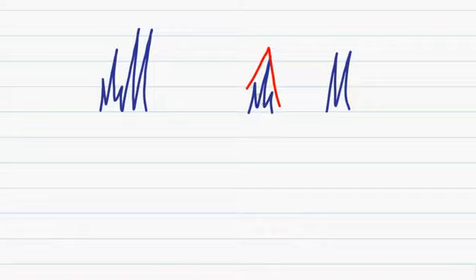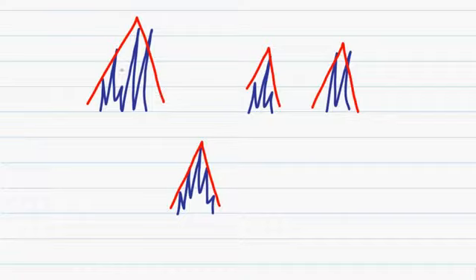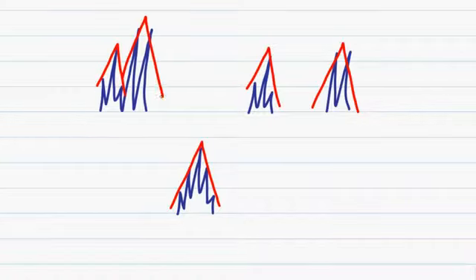Notice that when I draw a triangle over this peak, I wind up hitting every single tip. Same thing for a doublet. And the same thing applies for this complicated quintet. However, going back to my original peak, if I try to do the hat trick, notice that I have this peak right here that does not fit and so I know that it's incorrect. However, notice I can draw two separate hats or two separate triangles and this shows me that these are actually two peaks that are overlapping on the graph.